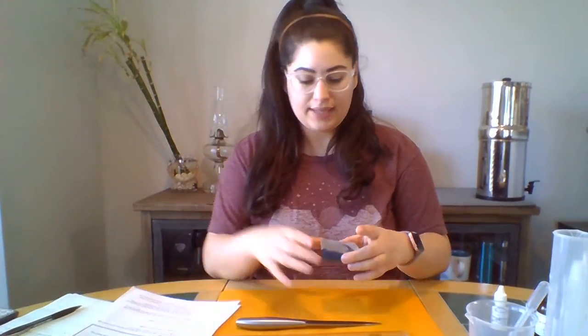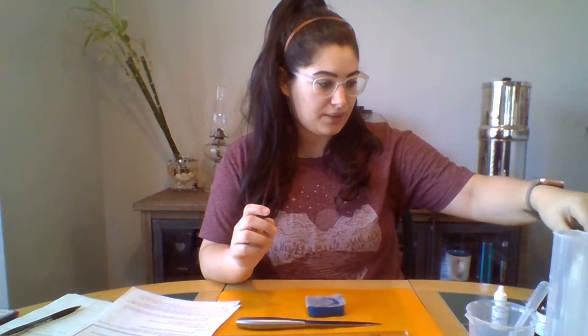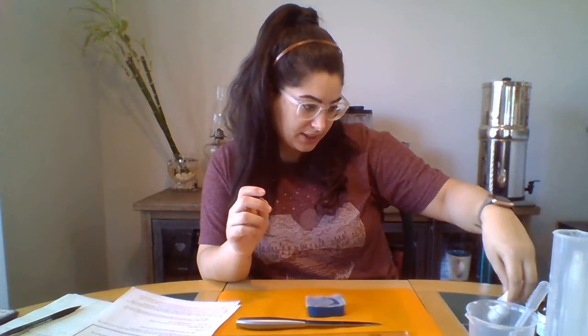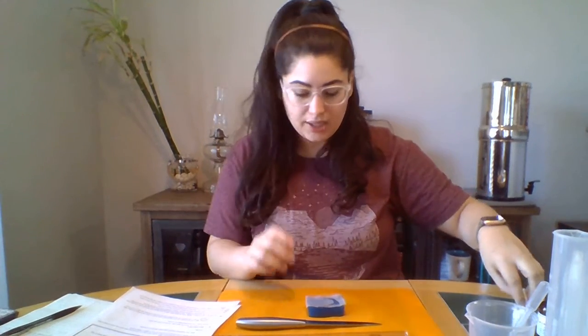I am going to complete lab number 3, experiment number 2, exploring cell size. And I have already completed the agar preparation. I have a picture for that I'll include in my submission. But it has been all mixed up with the nutrient agar, the bromothymol blue, and the saturated sodium bicarbonate.